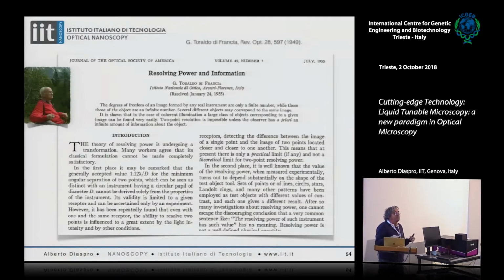Okay? Are you violating physical laws? Is your microscope exploding sometimes because of violating physical laws? You can take this risk. I don't think so. And which is the additional information you have when you play this game with a confocal microscope? It is that point by point, you know the position of your investigating beam and of the origin of the signal. If you add this information to the image reconstruction process that uses lenses that are diffraction limited, you can improve the spatial resolution by this factor.